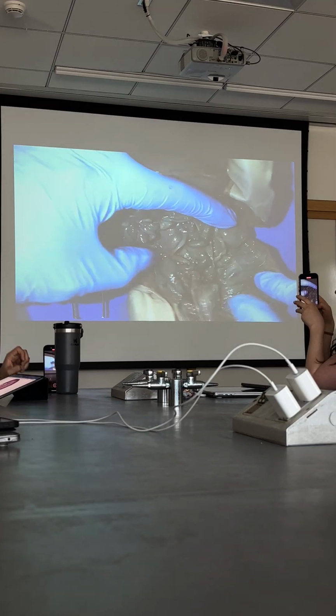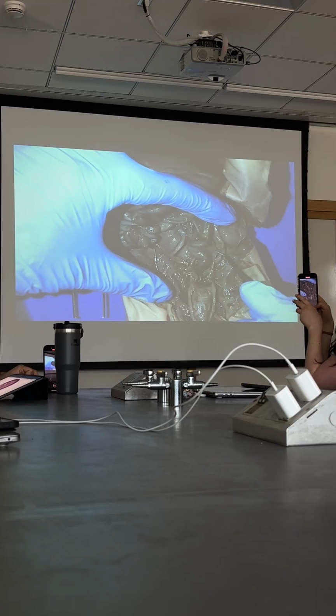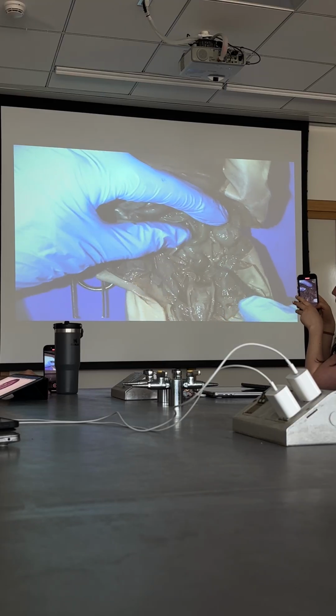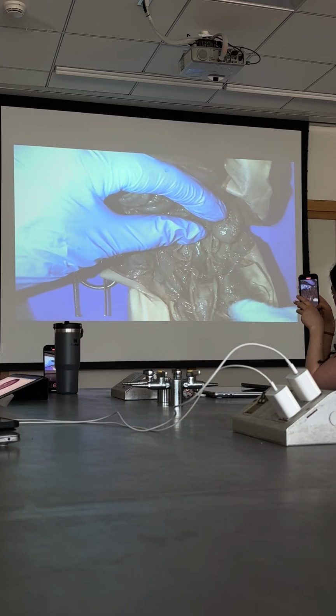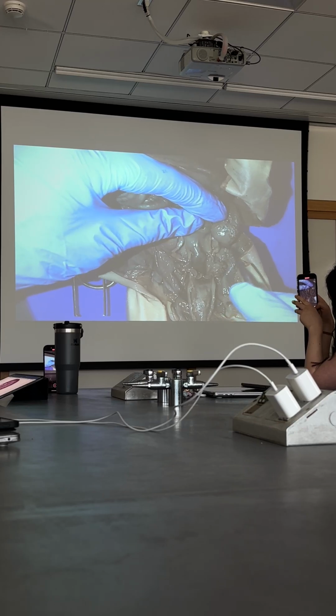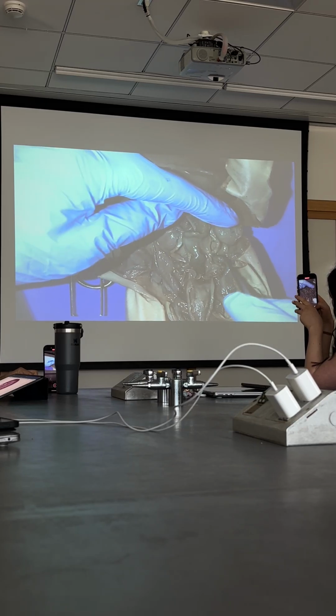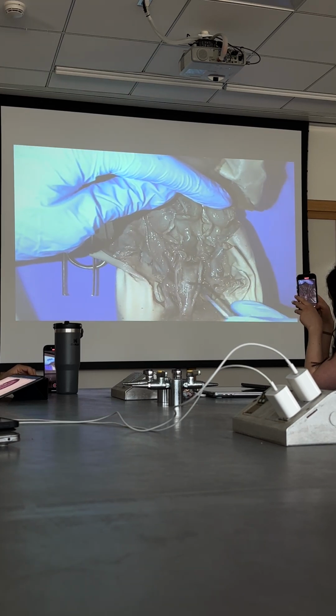And what they're going to do is they're going to come down. They are going to go behind a bunch of other things. There's some little blood vessels and nerves running in here. But if you trace and follow that ureter, and this is a female fetal pig, this is the fallopian tubes and the ovaries. If you do follow those ureters, they will eventually connect up with this thing that's right in the middle.